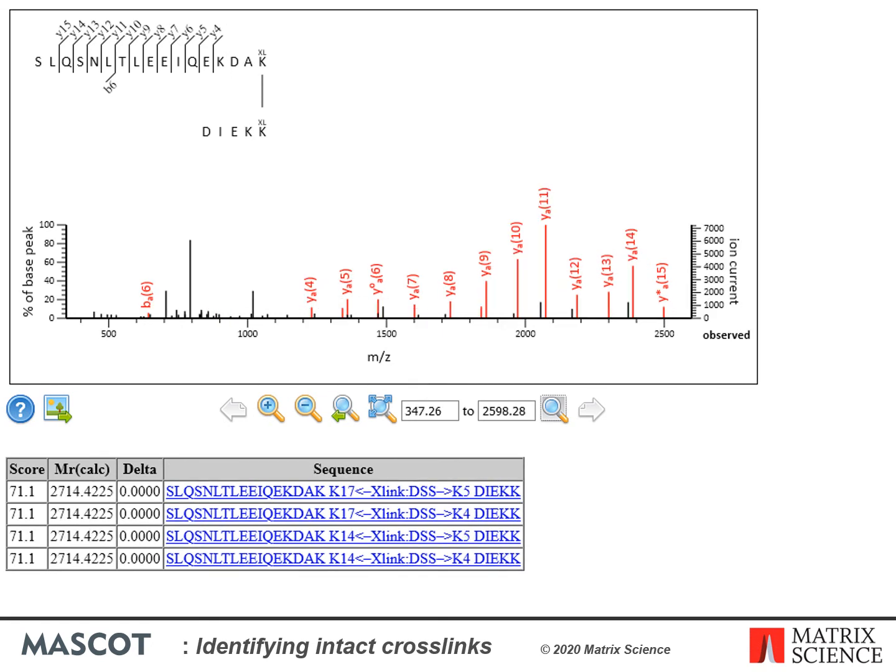Finally, this cross-linked match is very similar to the previous one, with no fragmentation from the beta peptide. But in this case, the search space has no other alternative for beta. If we assume the search space is complete, there's no reason to doubt the identity of the beta peptide, even if there are no beta fragments in the spectrum.